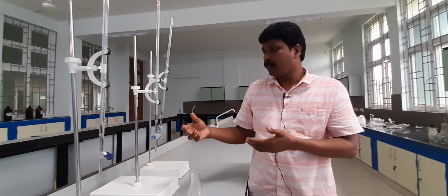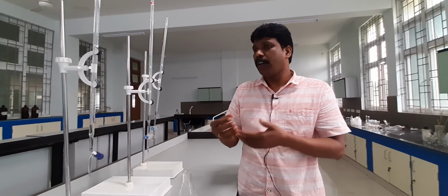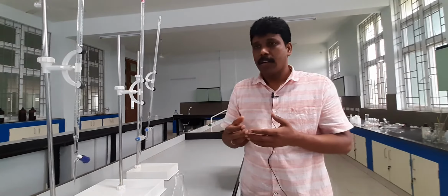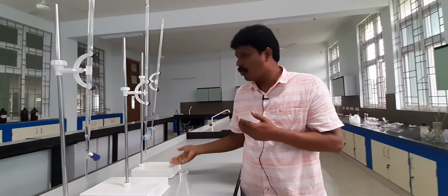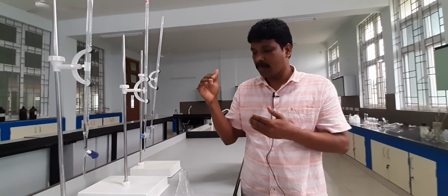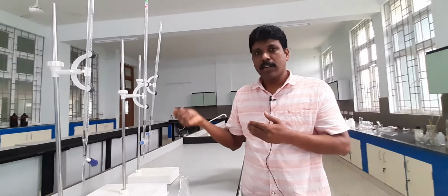Now after that, in each conical flask you can prepare a different composition, keeping the total volume of the acetic acid and chloroform constant, while the water can be varied.